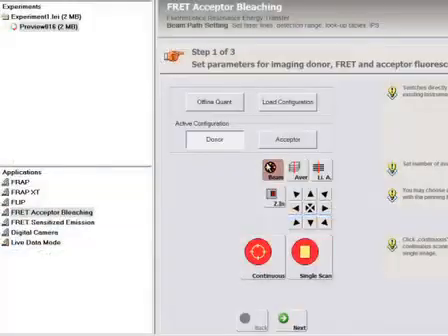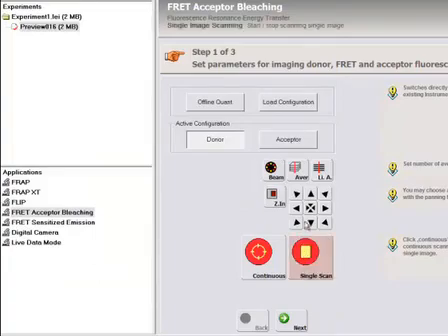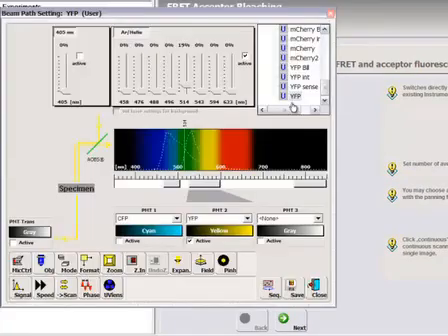Using the sequence setting for the Leica confocal software, locate cells expressing similar levels of CFP and YFP with proper membrane localization. Using the Leica software acceptor photo bleaching program, set the donor and acceptor settings to your saved CFP and YFP settings respectively.